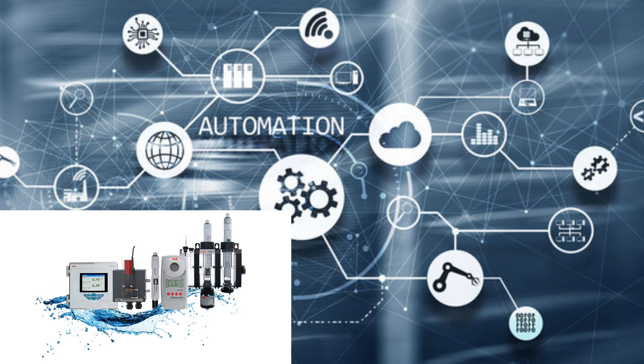That's wild. This whole deep dive has really opened my eyes to how complex and important turbidity measurement is. It's not just about, is the water clear or not? It's about public health, industrial efficiency, the whole thing. But with all this talk about accuracy and precision, I gotta ask, are there any limits to this technology? What happens if the water is super turbid?